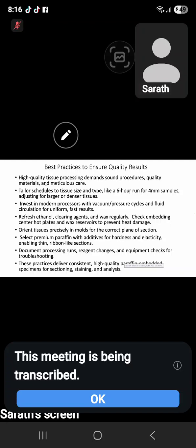Then refresh ethanol, clearing agents, and wax regularly. Don't leave it for 2 weeks, 3 weeks. Regularly, you have to change them.